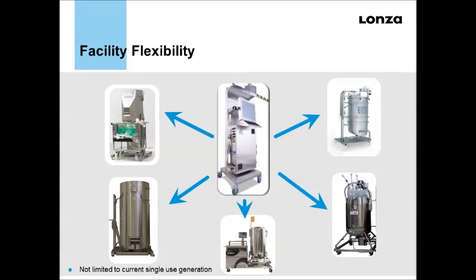Also, we're a contract manufacturer, which means everyone has their own favorite bioreactor. So while we use a Finesse controller, we are using all different types of bioreactors and proving that you can use them generally comparably. I will tell you that some of the cells like certain bioreactors better than others just because of the configuration of the bioreactors, the configuration of the agitation. But in general, we can move them around. The trick is really around the controller.